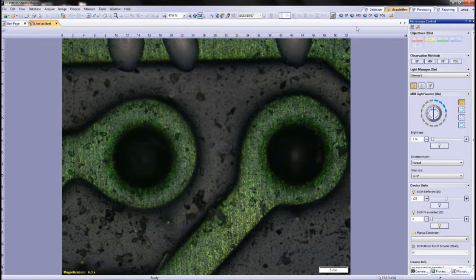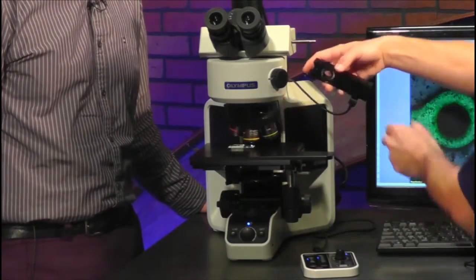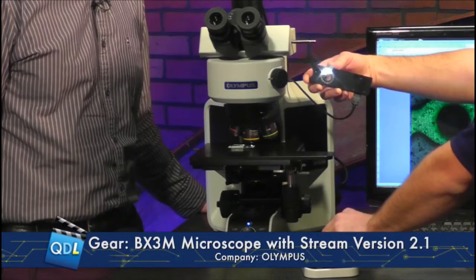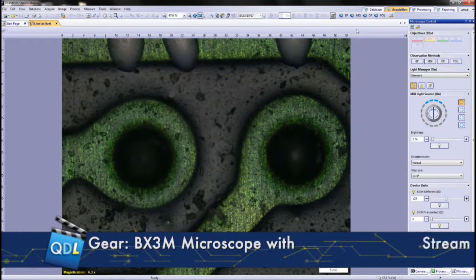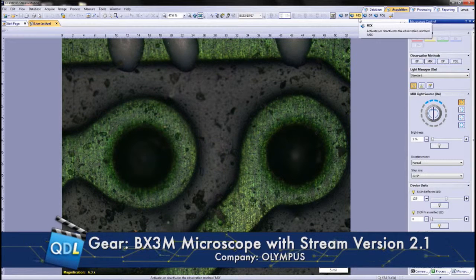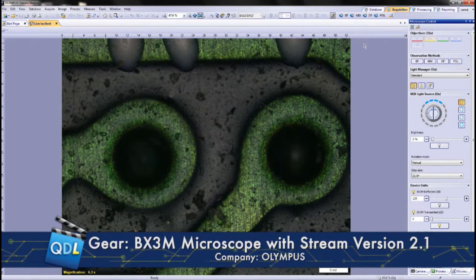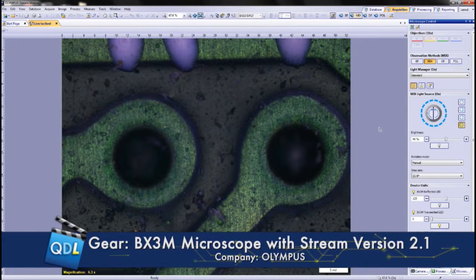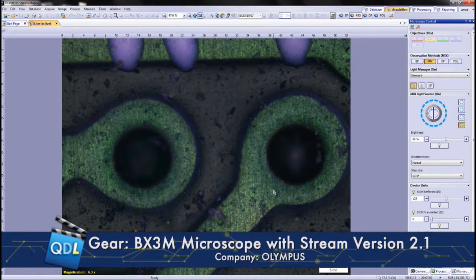To show how mix mode looks on the sample, here's the hardware: the mixed light source goes in with different quadrant lights, and with the hand switch you can rotate around the quadrant lighting. What we see live on screen right now is normal bright field, but when we turn on mix light we get more definition around the edges of the sample — wherever there are protrusions or surface features.